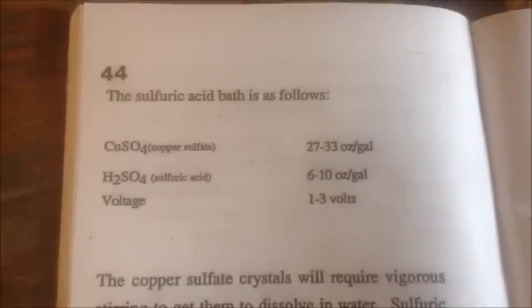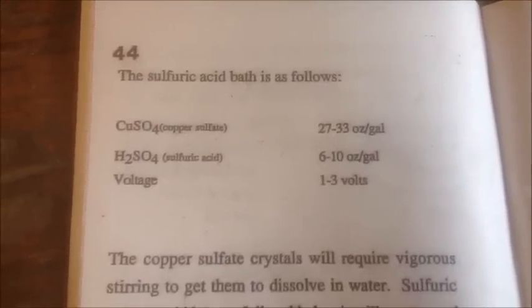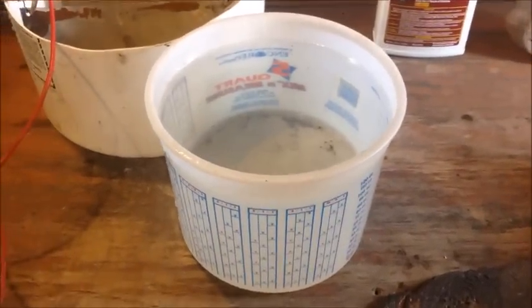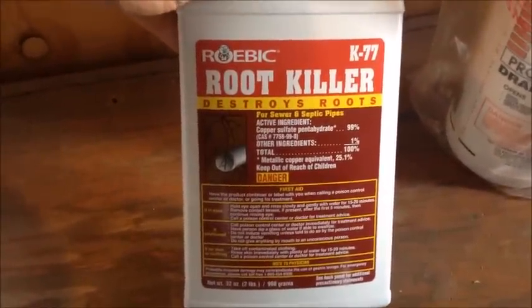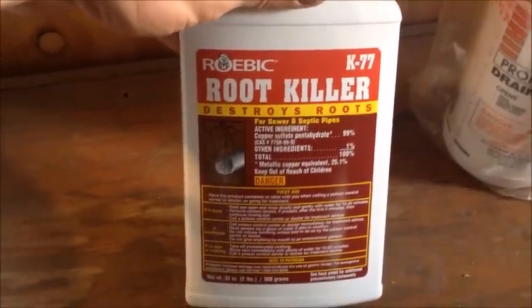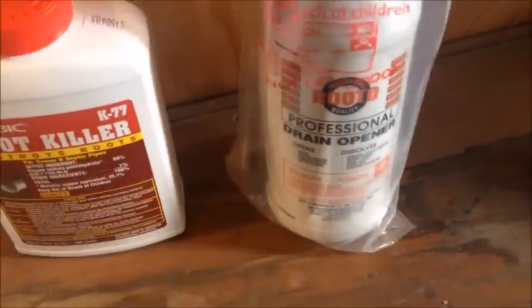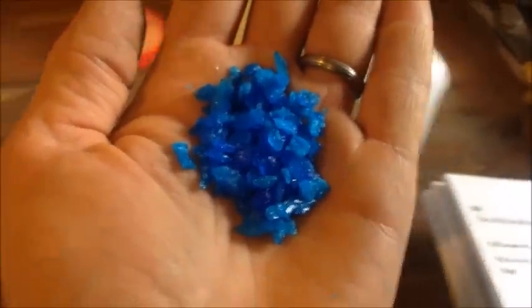The gold and silver will not go into solution — they'll fall out as anode slimes into the bottom of our bucket. Here is the recipe: about 30 ounces per gallon of copper sulfate, about 8 ounces per gallon of sulfuric acid, and between 1 and 3 volts. The copper sulfate is a septic tank root killer with 99% copper sulfate pentahydrate as the active ingredient, and the sulfuric acid is a drain opener — both from the hardware store.